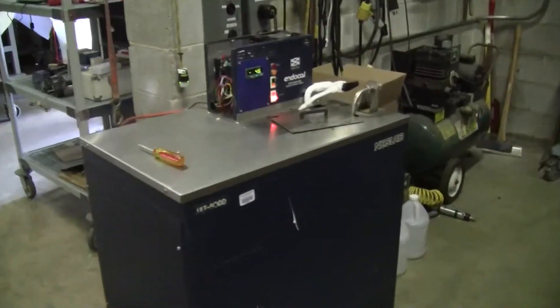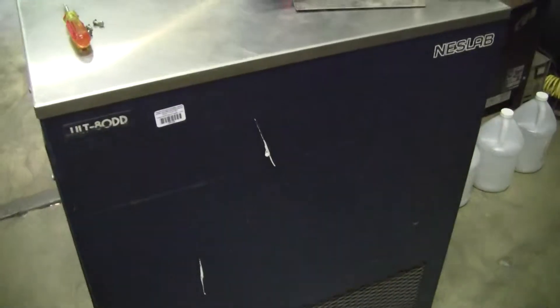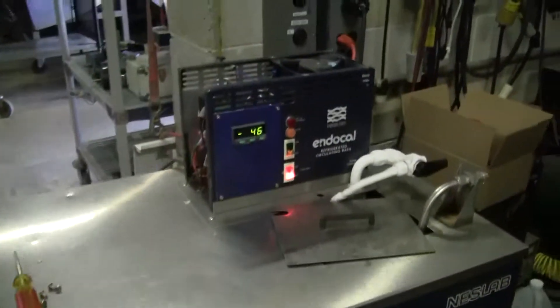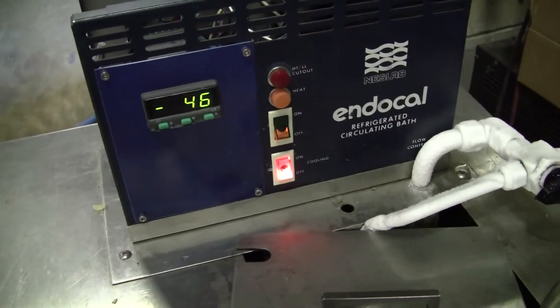Hi, this is Michael Natow from Hi-Tech Shitter. Today we're looking at a ULT 80 Nest Lab, a classic unit that goes down to minus 80 degrees. We have it currently running at negative 46 degrees.